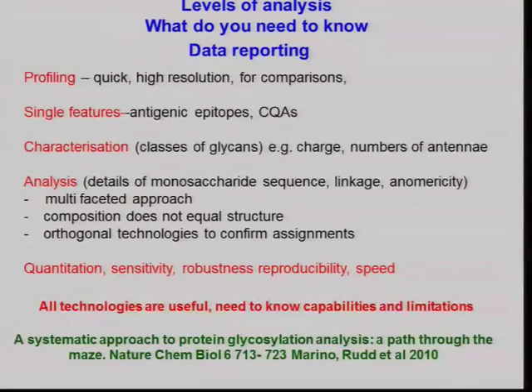So you need to know that, because lots of the literature is really full of glycan analysis where they've put a structure there, but actually there's no evidence for that structure. That structure just represents one possible arrangement of the composition. And the other thing to be aware of is that one type of analysis is not enough.